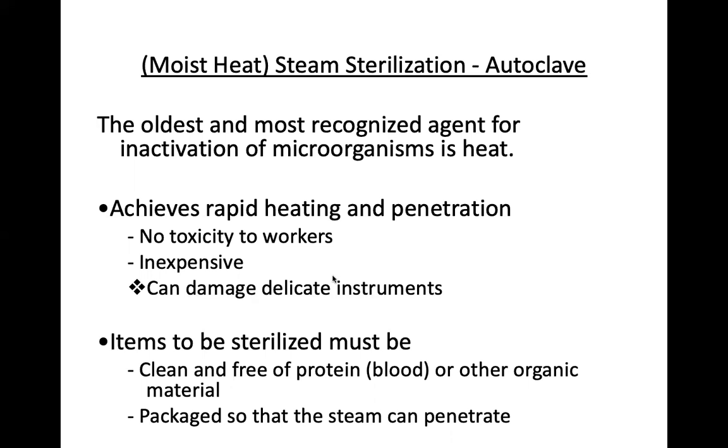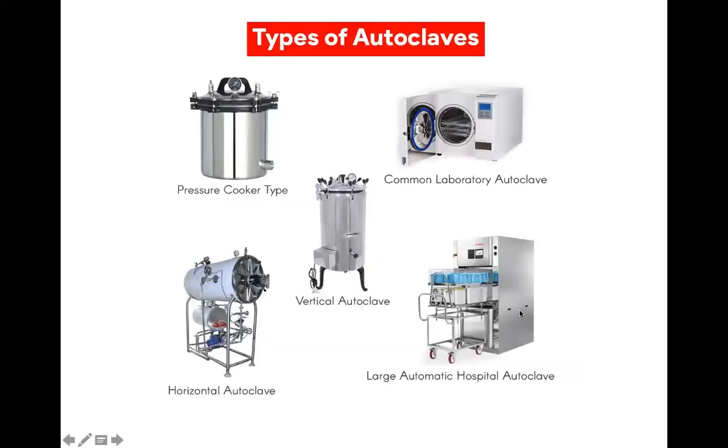In terms of sizes and shape, some of them are large scale. Most of the current ones are automated. Once you just set the temperature that you want and the timer, it has an inbuilt quality control that comes with each process once it ends. So you can actually see whether the correct temperature was attained and if it ran for the correct time. We have the external quality control that you need to incorporate, which is the monitoring of the autoclave.